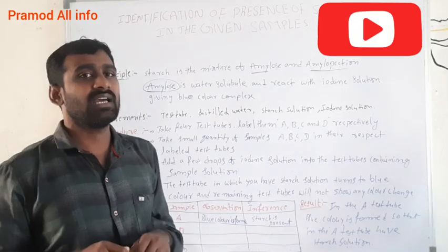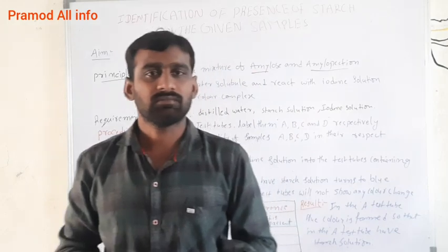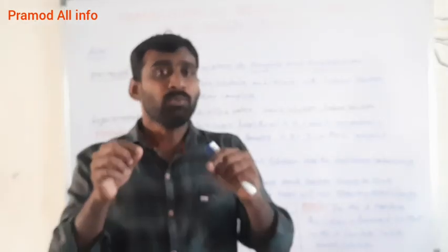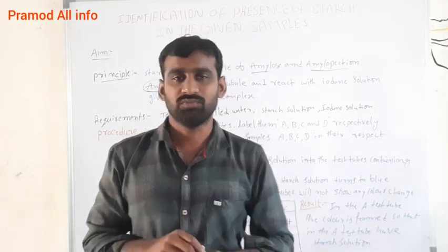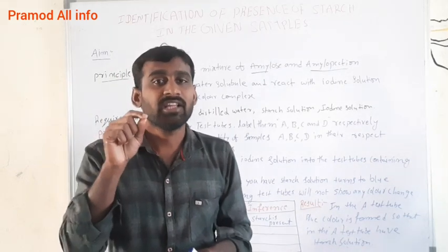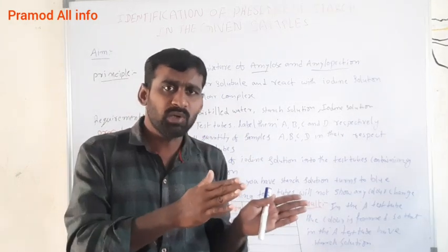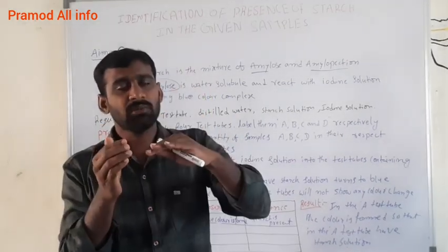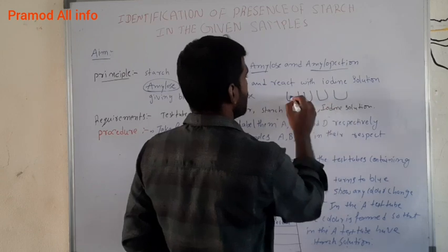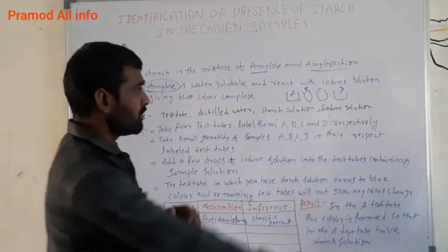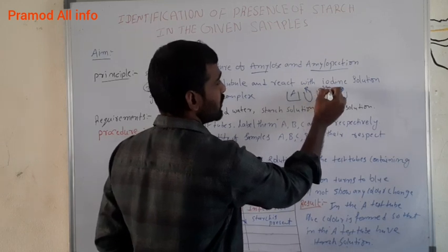I will now show you the test tubes. This is the test tube — the blue color is formed in this one. These are samples A, B, C, D — this sample contains the starch solution.